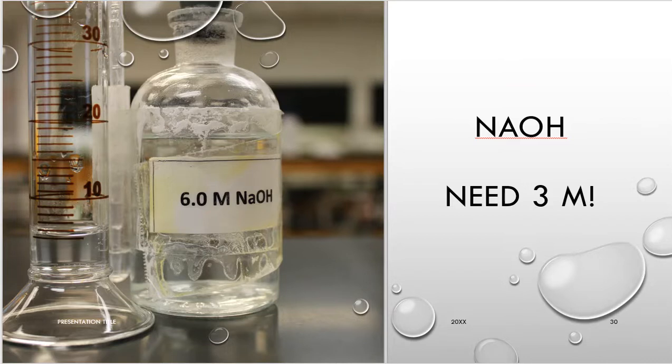All right, so in the next step, it's going to ask me to add 3 molar NaOH, and I didn't have any of this on hand. I was going to have to make it myself, and I've made it from a 6 molar NaOH solution that was already prepared for me by someone else. So this is just a stock solution of 6 molar, and I need to make a 3 molar, so I need to cut this concentration by half, right? This is pretty easy to do in my head.